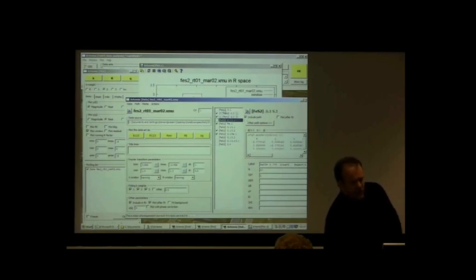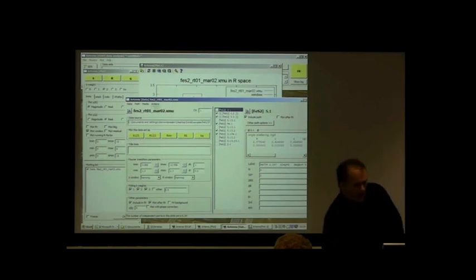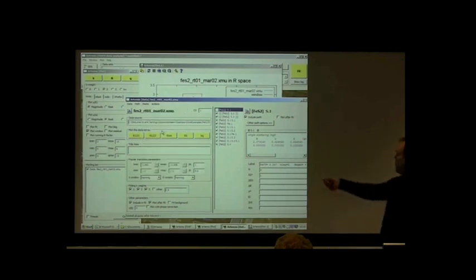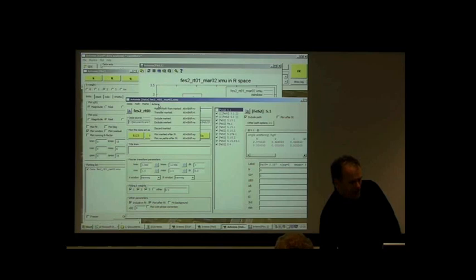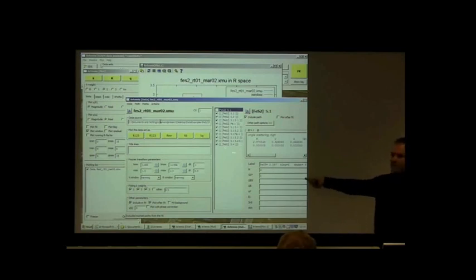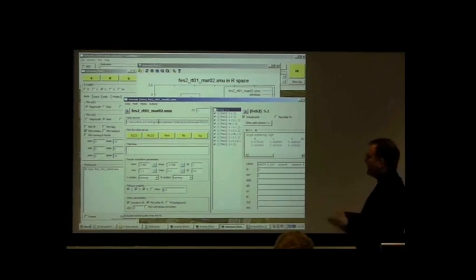Right now I want to go click, click, click, and so on, but that's a little bit tedious. So instead I'm going to click on the first path, go to the Marks menu, and say Mark After Current, and that put on all the tick marks for everything except the one that I was on. I then go to the Actions menu and say Exclude Marked, and now I've taken all of these out of the fit. So we're almost there. We've set the fitting range. We've included just the contribution from the first neighbor. Now we need to somehow parameterize the fit.